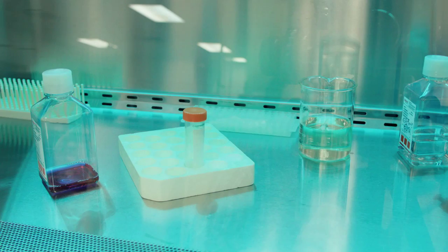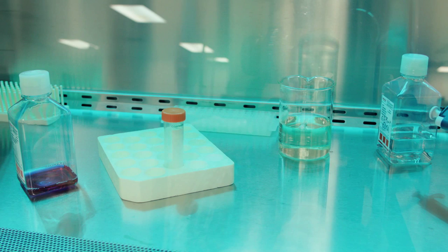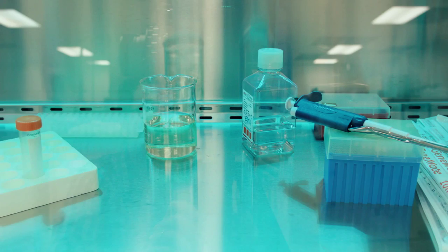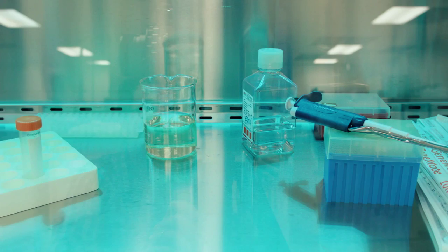There's media, PBS, and there's a little beaker of 10% bleach, which is basically how we inactivate the virus. So any tips we use or any tubes we use go into the bleach, and then we let them sit there overnight, and then the next day can throw them out safely.